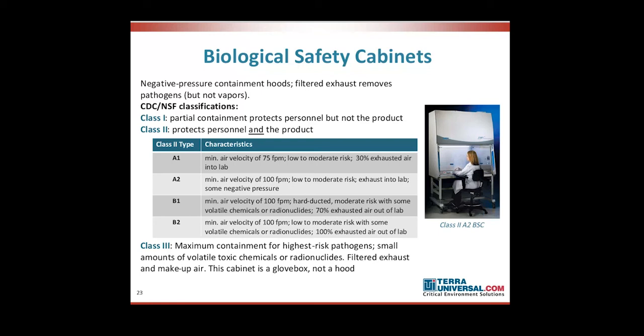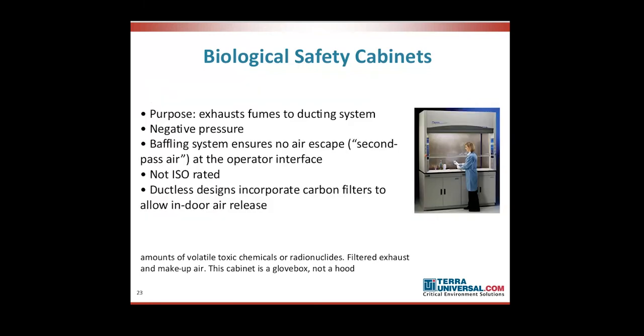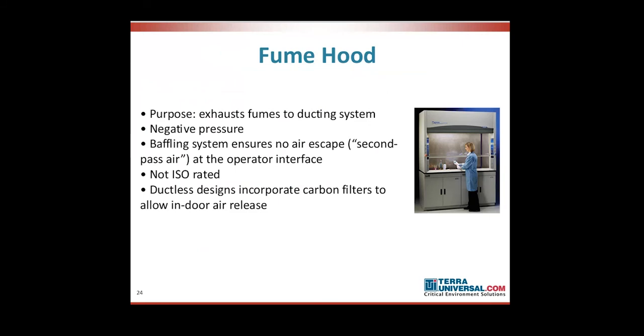The fourth category is a fume hood. You may have run across fume hoods from time to time. Fume hoods are not recommended for compounding of sterile to sterile CSPs. Yes, the operator is protected from exposure to CSPs, but the intake air is not filtered, so your CSP is prone to contamination. Great question.